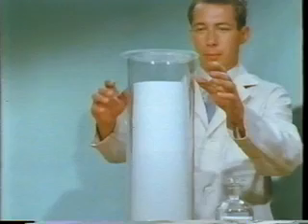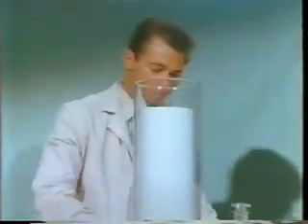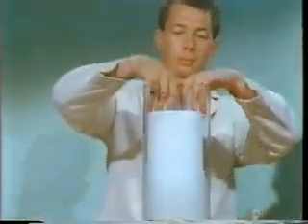The solvent is drawn up the filter paper by capillary action. After 12 hours, the solvent front has risen this far. The filter paper is removed and allowed to dry.